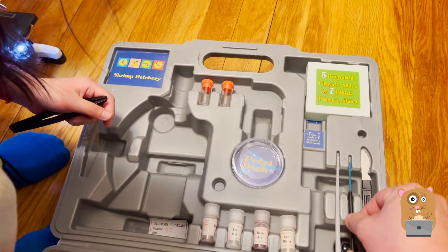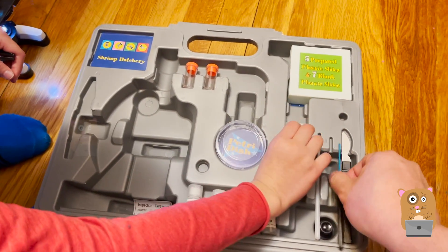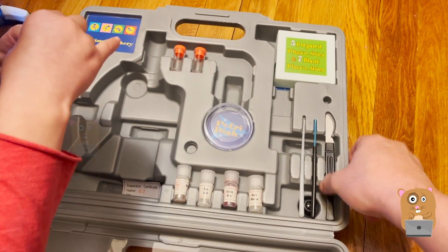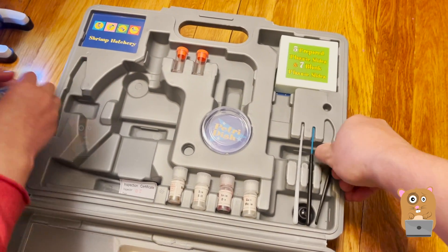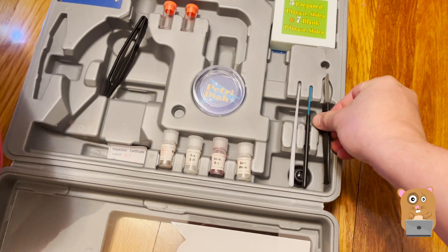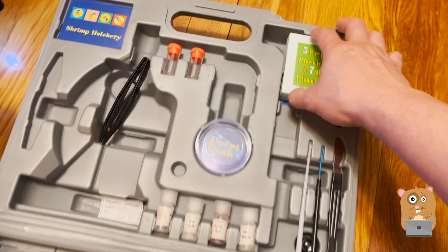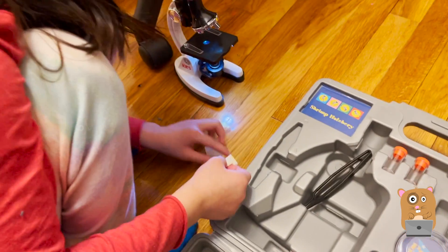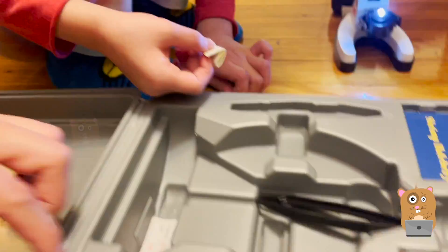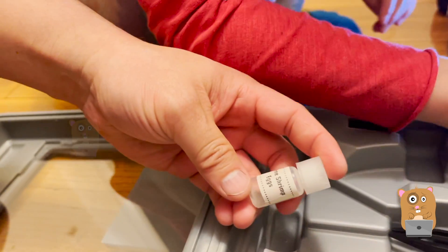Stop, don't touch that one. Don't worry, I'm careful with them. No, this is a sharp thing too. I wonder what this is. The knife is pretty dull. Also, this is a shrimp hatchery. I think we can hatch these eggs here.